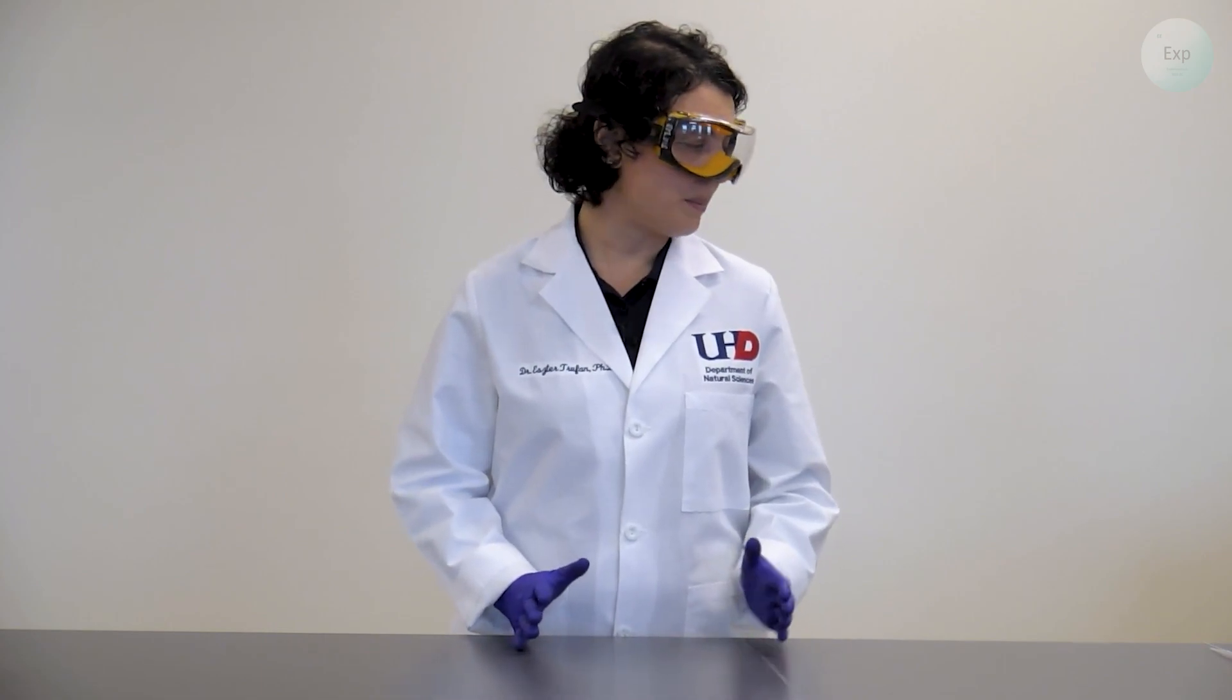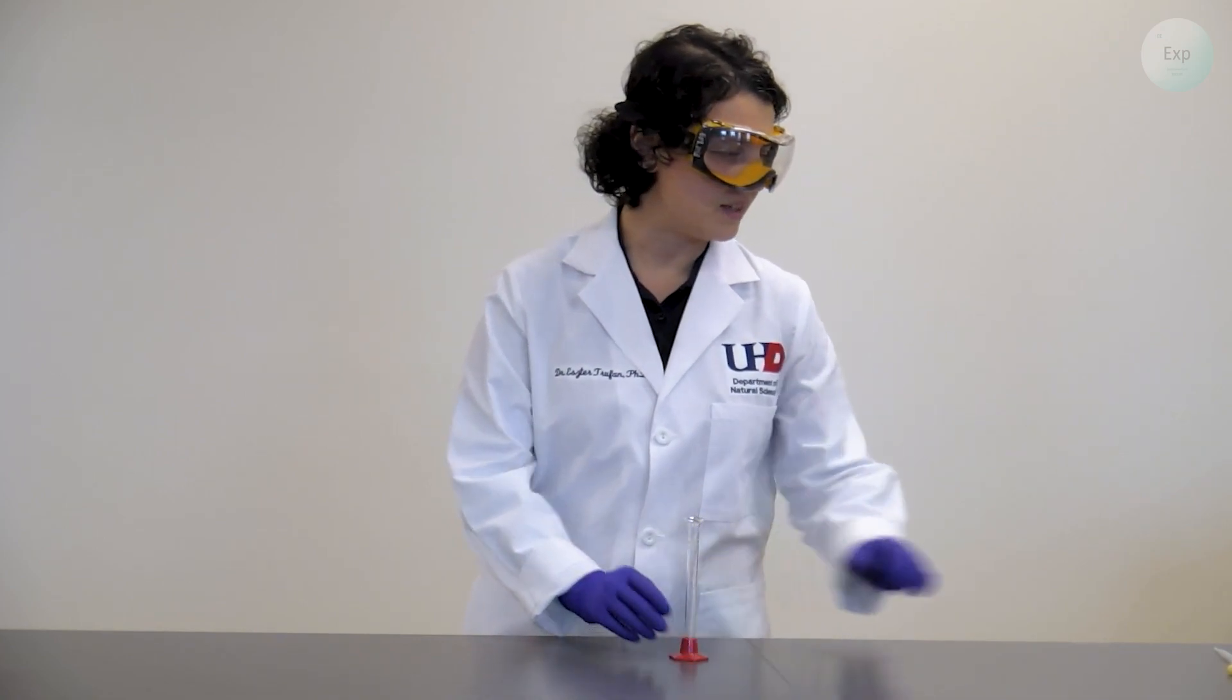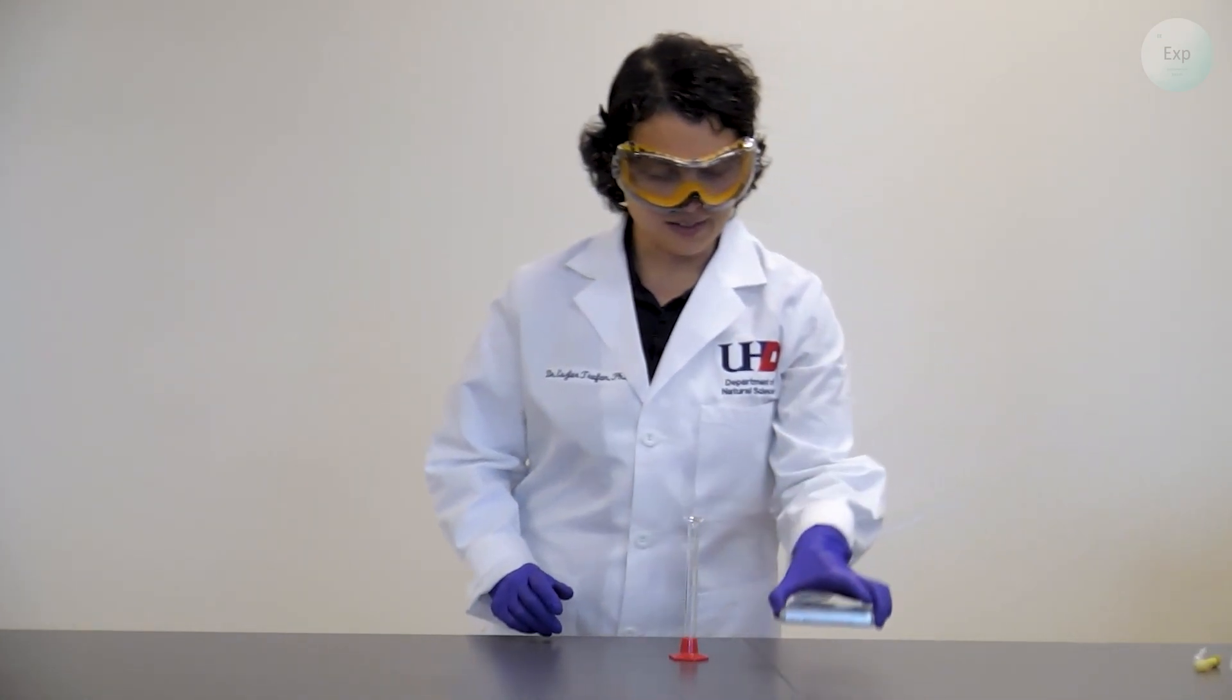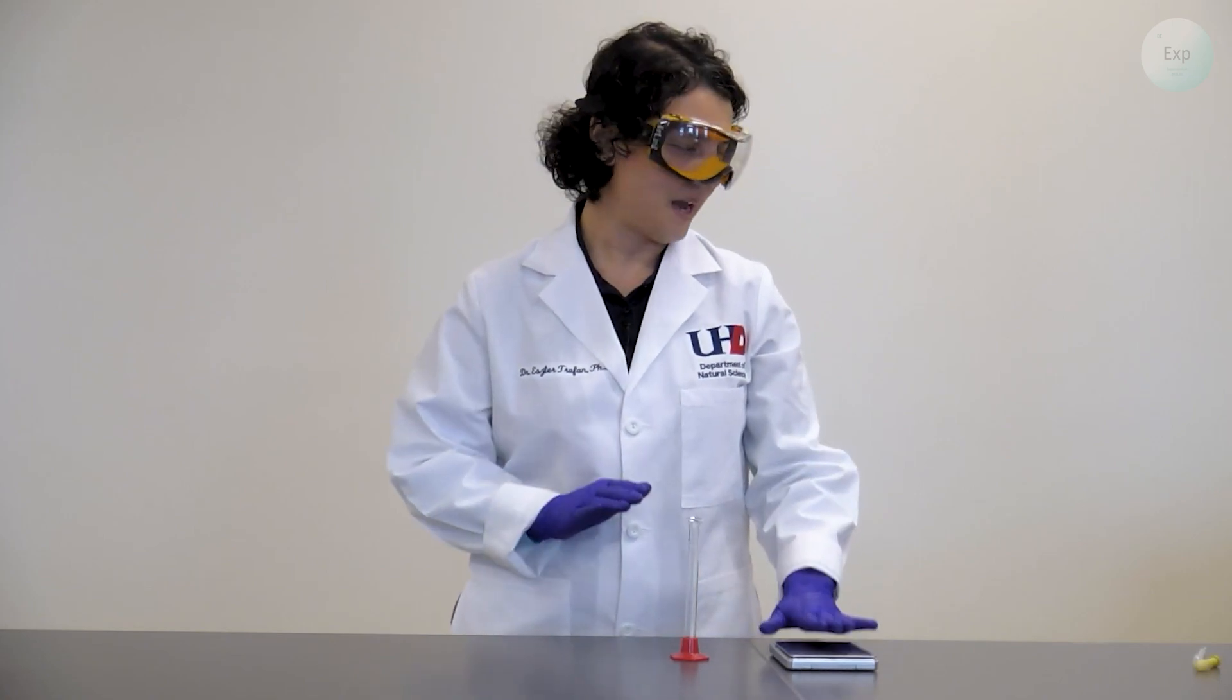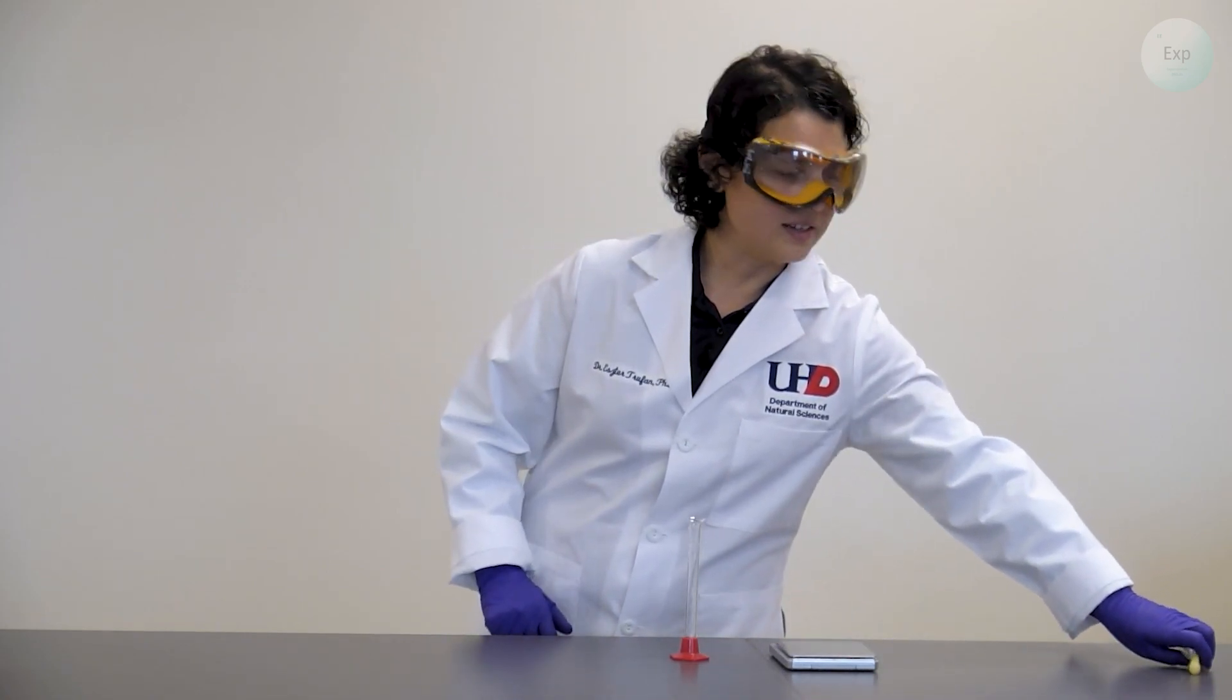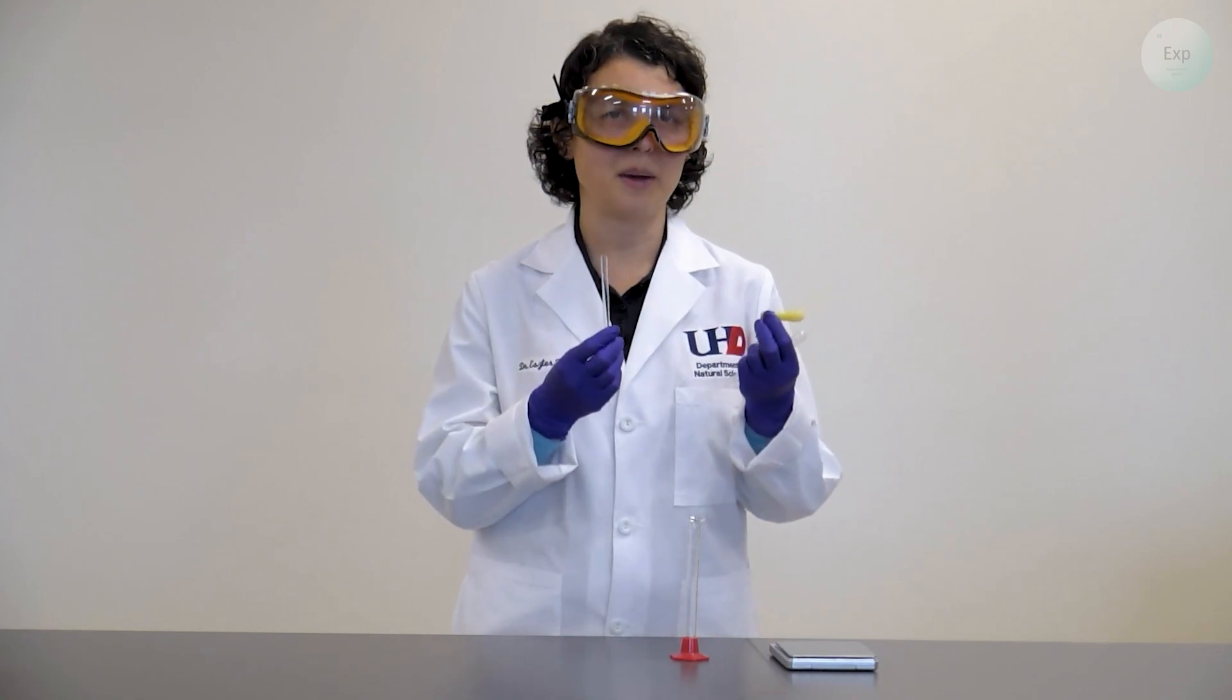The first thing that we are going to do is collect our equipment. We're going to need a 10 milliliter graduated cylinder. We're also going to need a scale, and to transfer things successfully without spilling, we'll need a pipette.